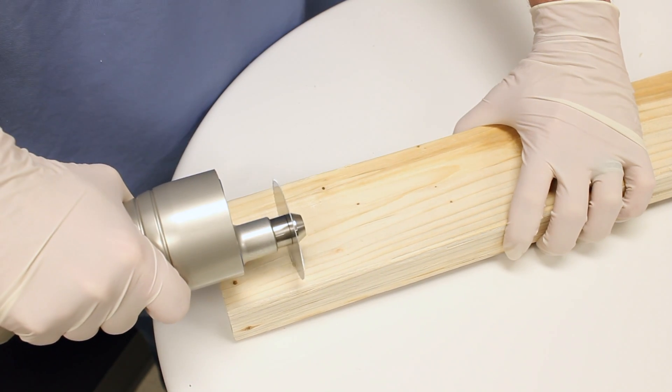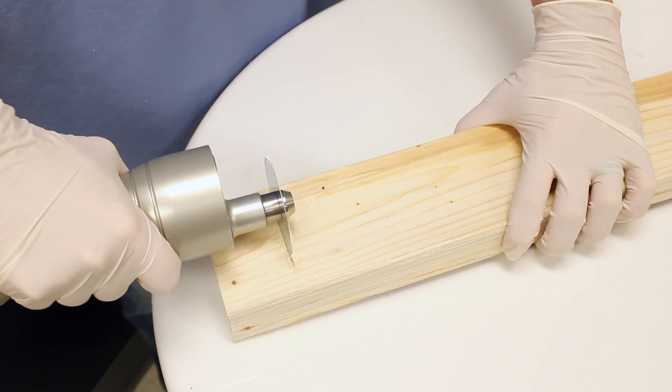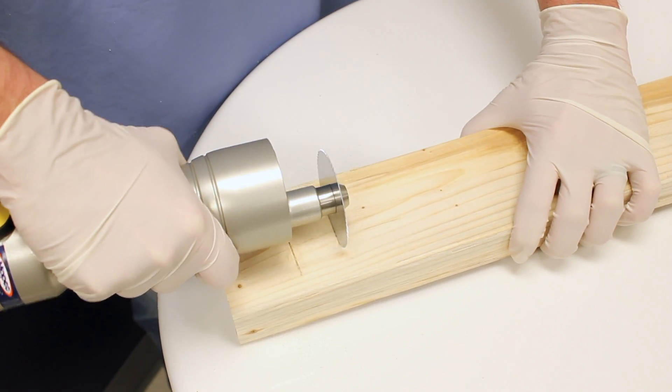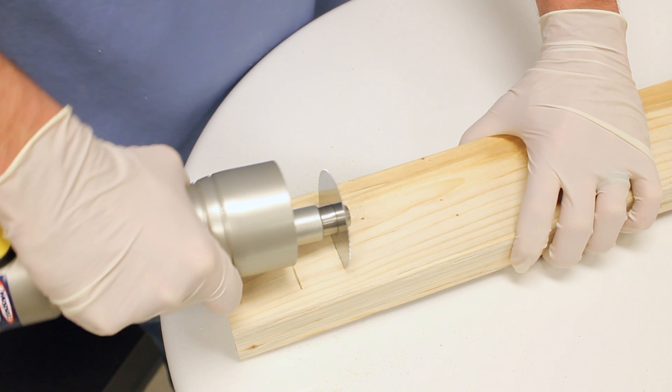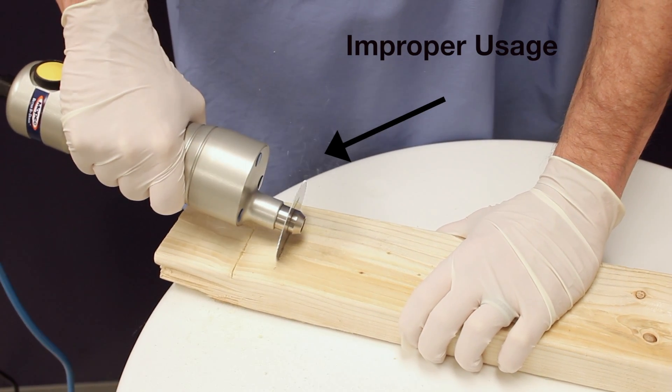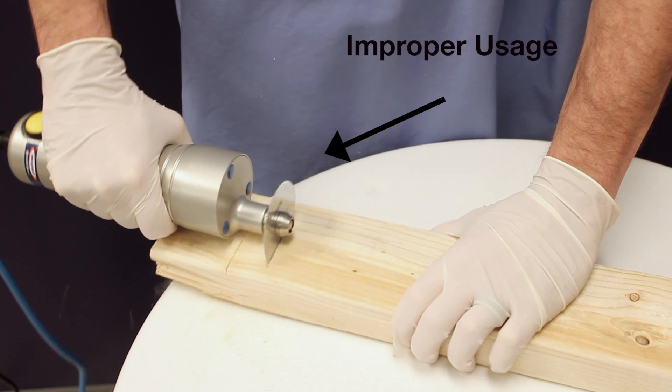Your Mopec 5000 Autopsy Saw is designed with an equal distribution of weight. When cutting into an object, hold the saw perpendicular and avoid adding excess pressure. Properly holding the saw will prevent any damage as well as wear and tear to the blades.